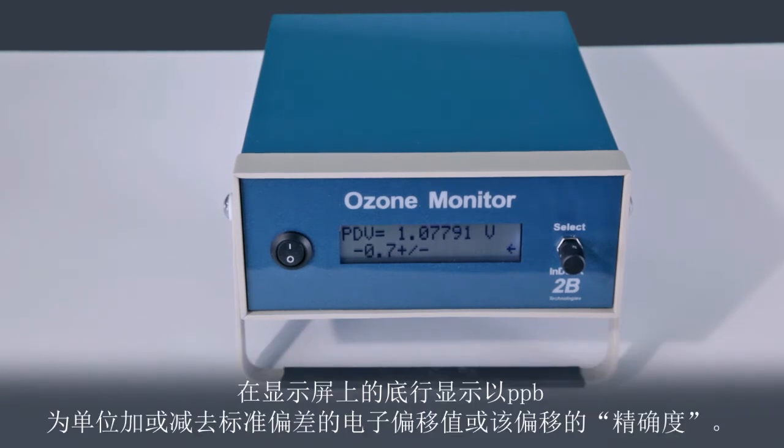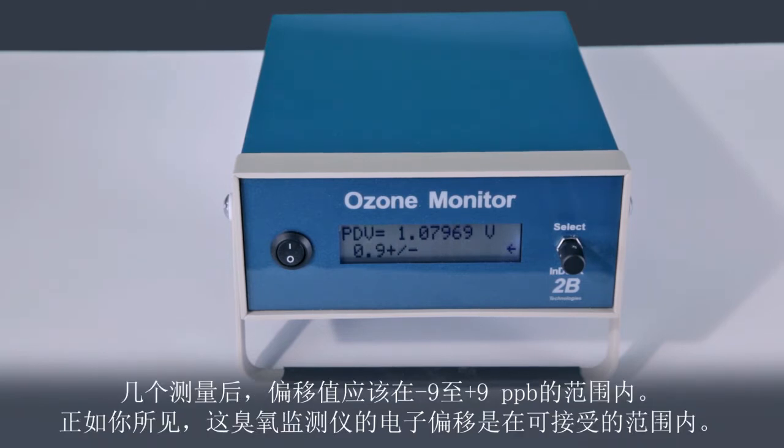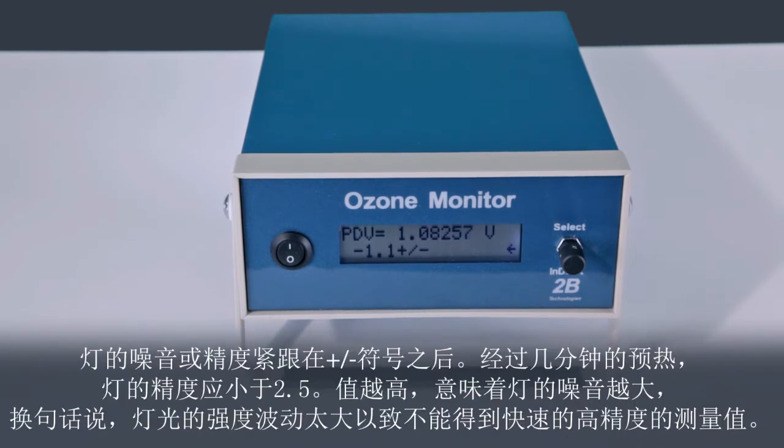The bottom line in the display provides the electronic offset plus or minus the standard deviation, or precision, of that offset. After a few measurements, the offset should be in the range negative 9 to plus 9 ppb. As you can see, the electronic offset for this ozone monitor is well within acceptable range. The noise or precision of the lamp follows the plus/minus symbols. After a few minutes of warmup, the lamp precision should be less than 2.5.